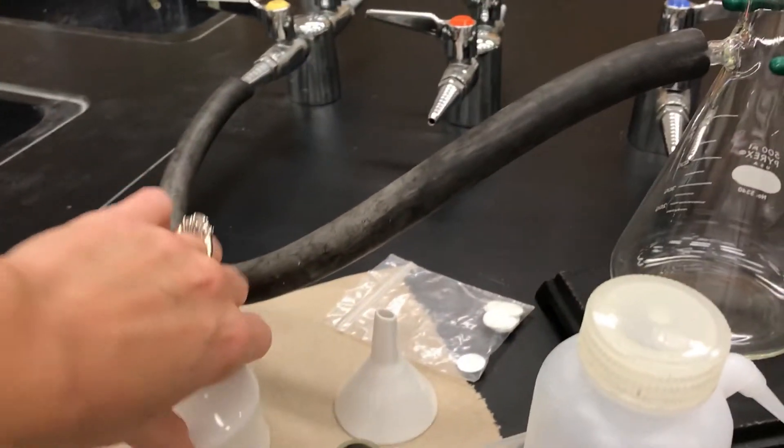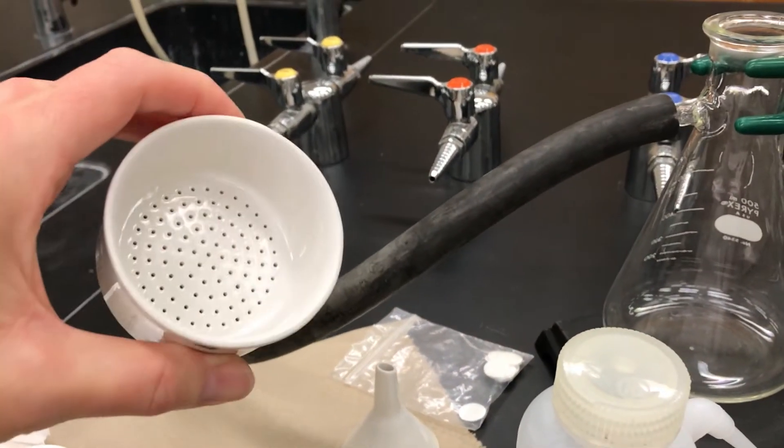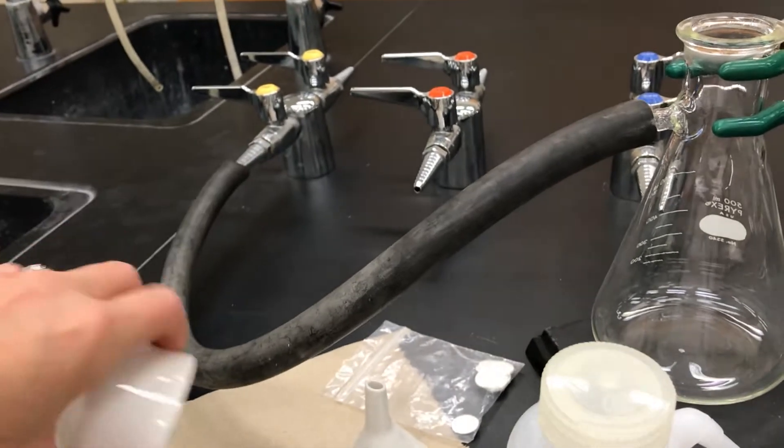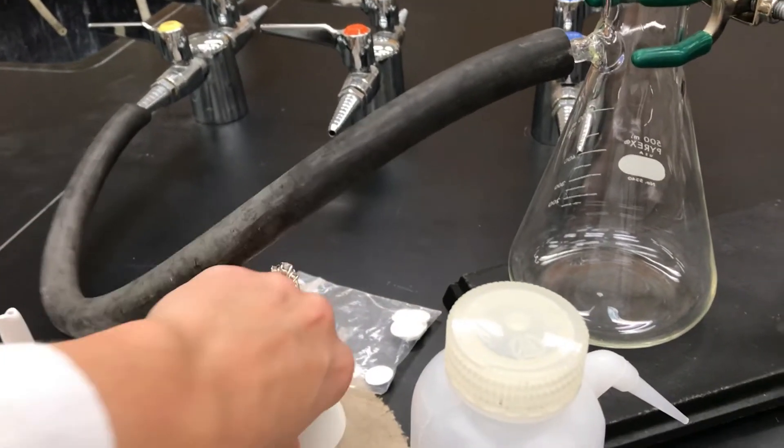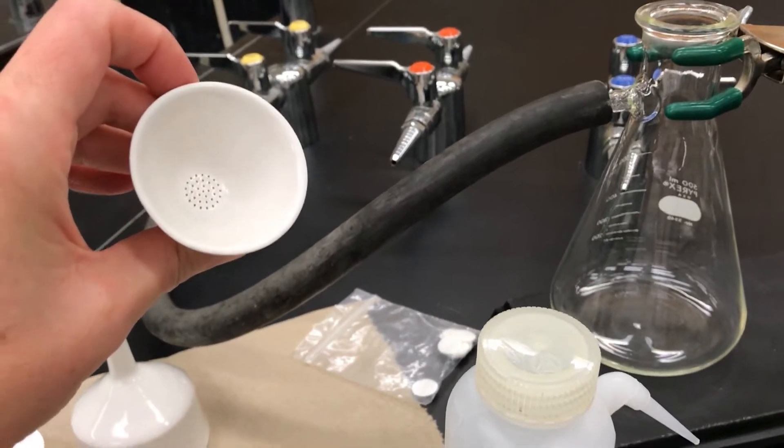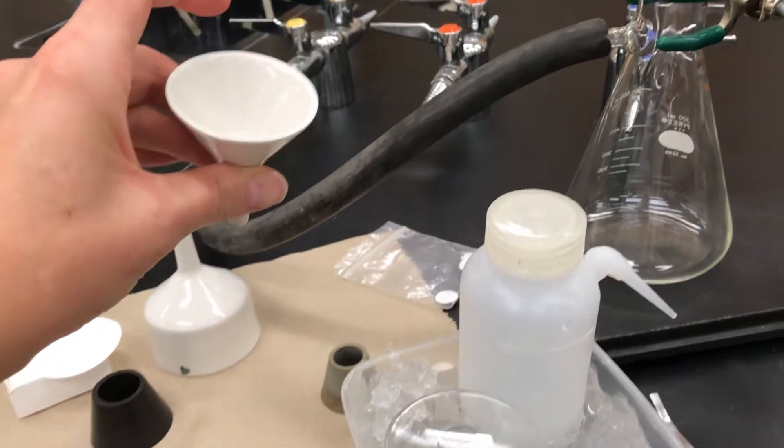We're going to need to use a funnel along with the filter flask, and they come in different sizes. This one's called a Buchner funnel—it's used for large scales. For the small scale filtration we want to use a Hirsch funnel, which is very small.